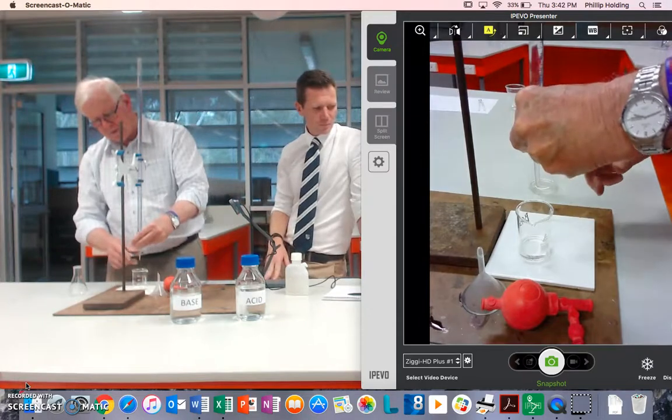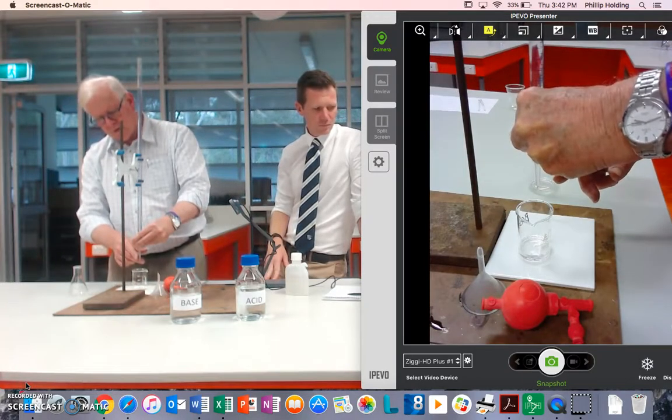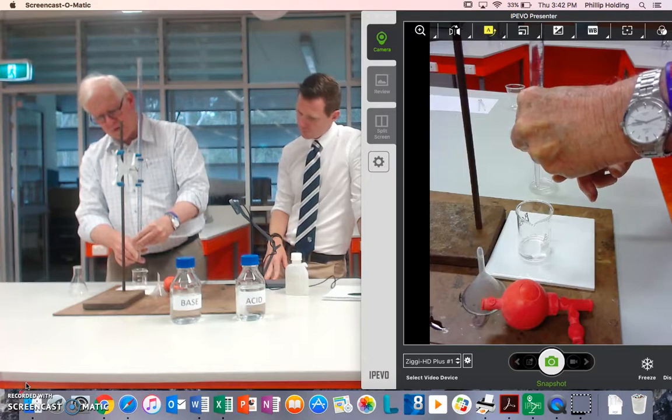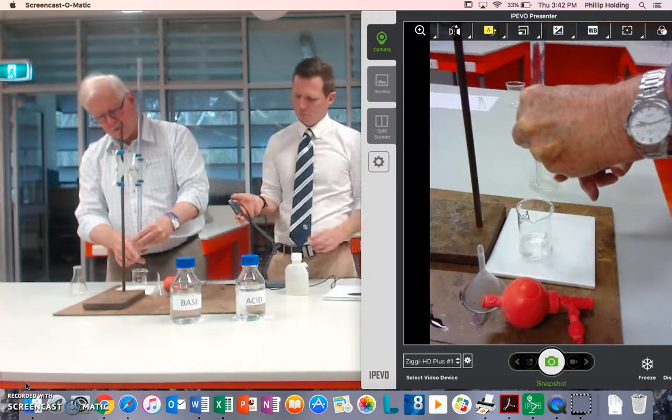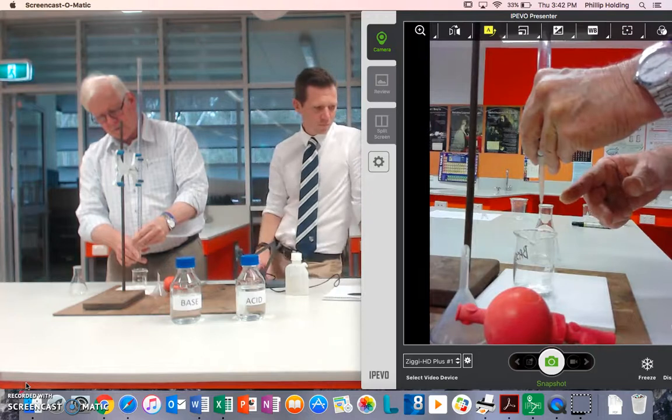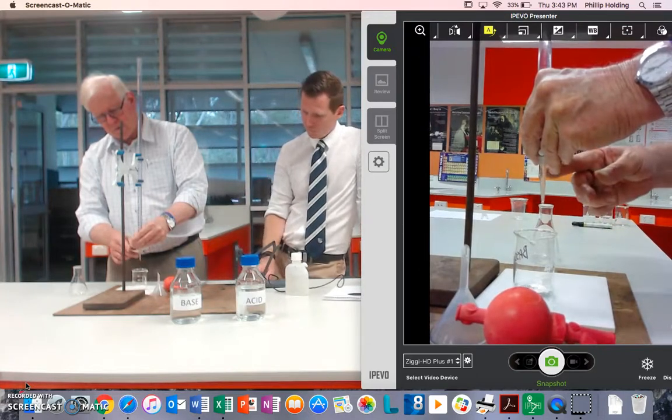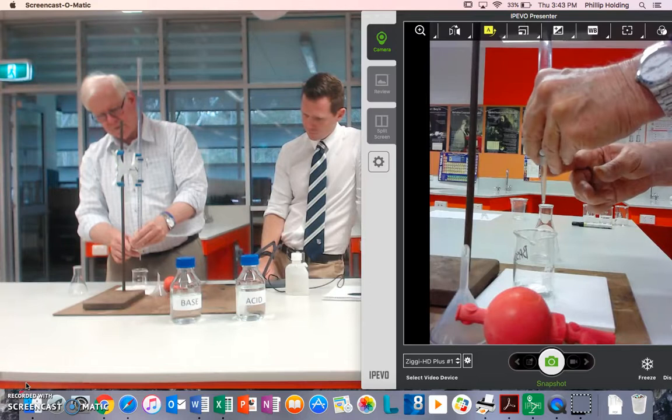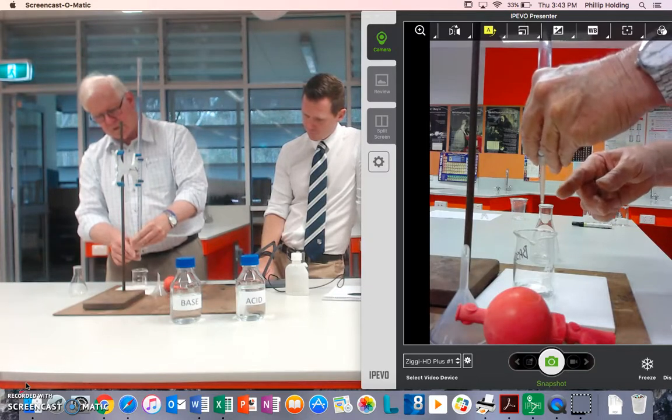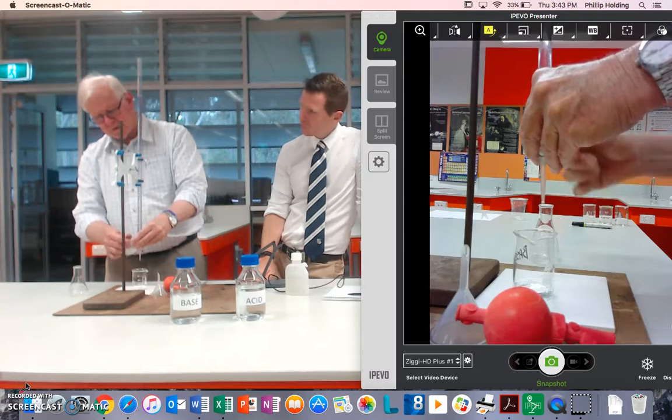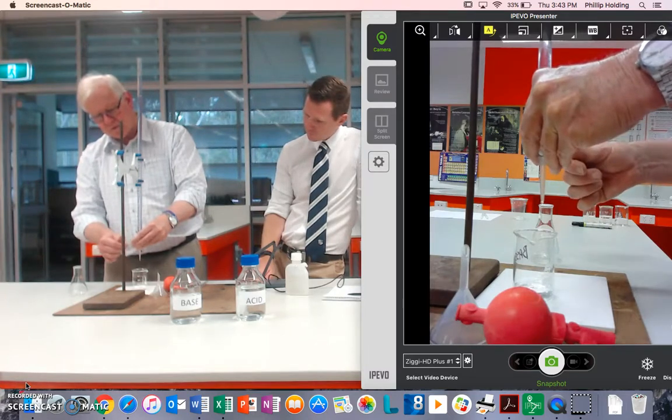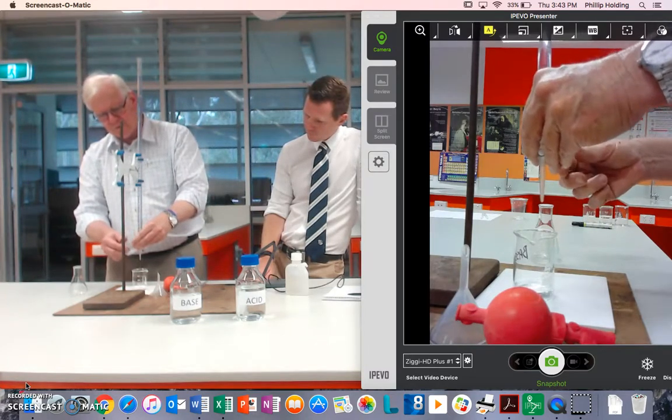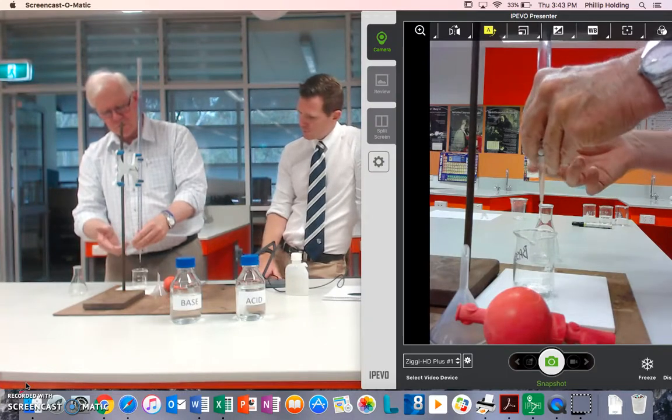But you start to get a feel, and you can see when it just starts to drop, and you can control that quite well. So you can have a full flow right down to that. And I'll just use my thumb to slowly turn that off so I can get it to that point, and then I can use my thumb on the other side. So I use my thumb each time just to turn the tap on and off. So my thumb is what's controlling all of that.